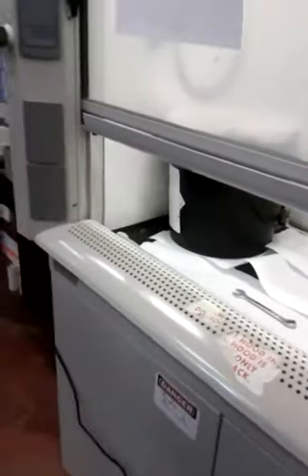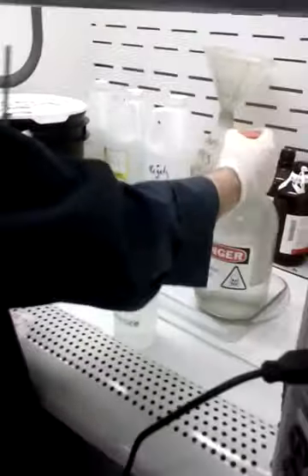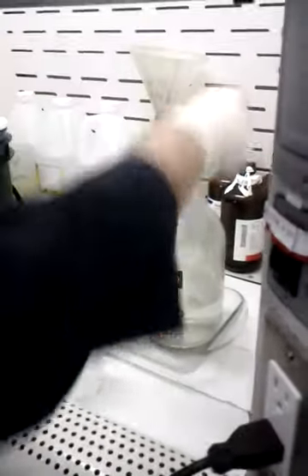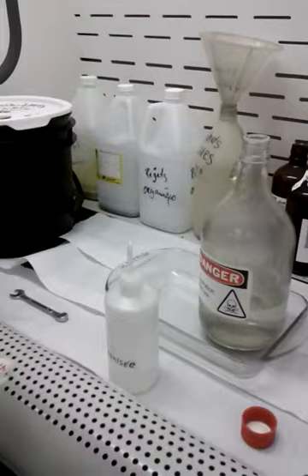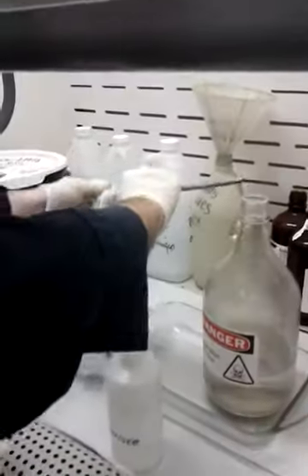We also do water. I need to open. Right. We remove the oil as much as possible. Now we go there.